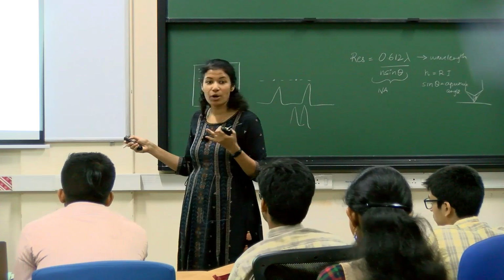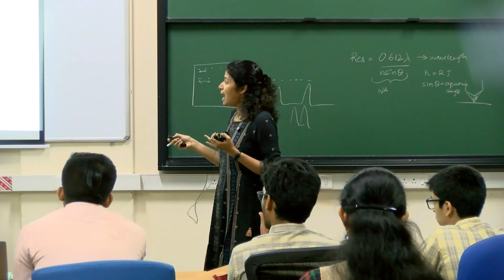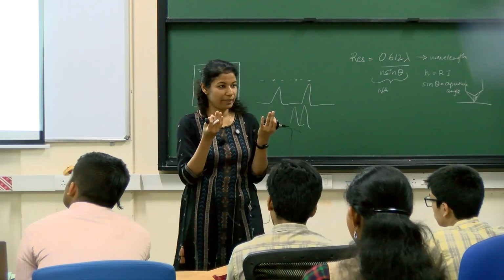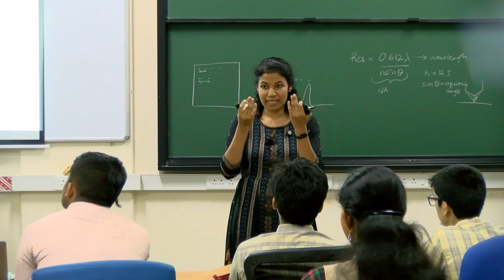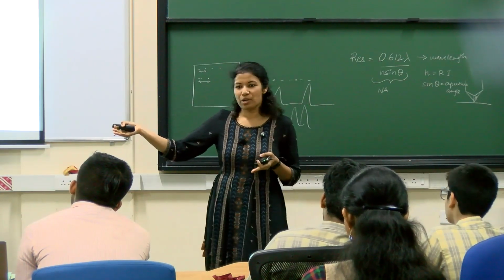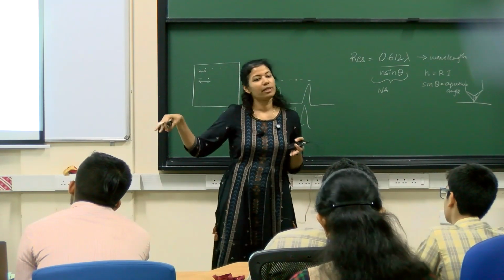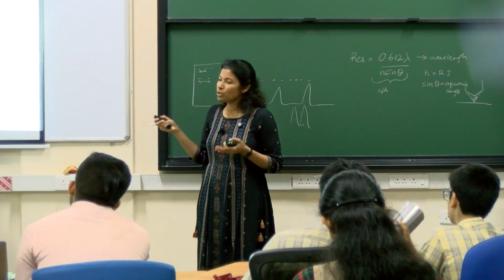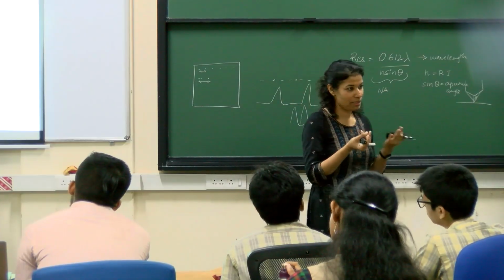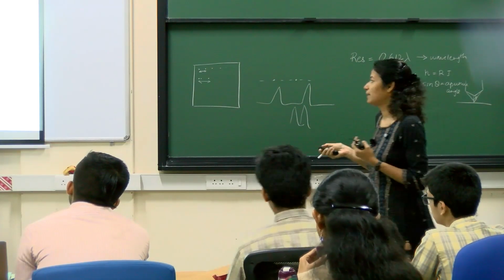So this is what is contributing to the magnification. And then here is your eyepiece. So your eye is your detector, basically. So you can see the image that is being formed. You can, in some cases, transfer it to a computer and see it on the computer. But most likely in the light microscope, you can see the image directly. So your eye can detect it, right?